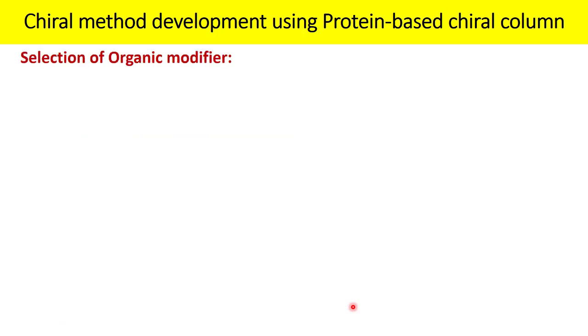Let us talk about the important point of the method development, and that is the organic modifier or the organic solvent. Because in case of your HPLC, you may use different organic solvent, and in case of the chiral separation, when you are using the protein-based molecules, can you use the reverse phase mode of your HPLC? Certainly, yes. I think we talked about this point at the beginning of our presentation.